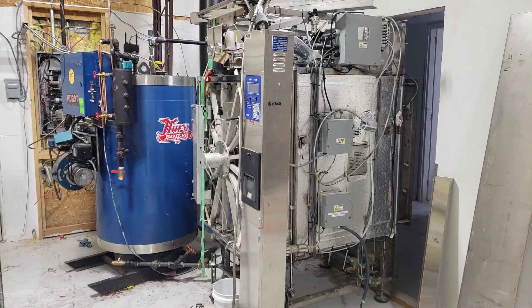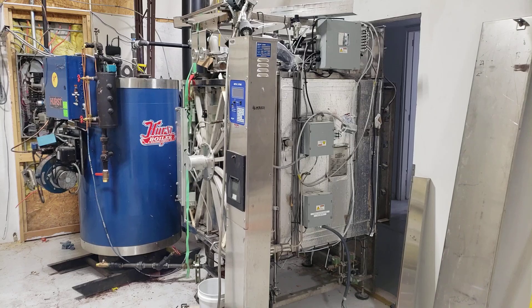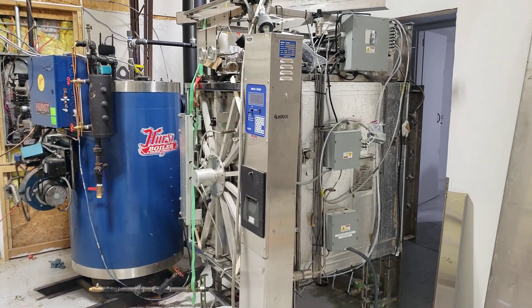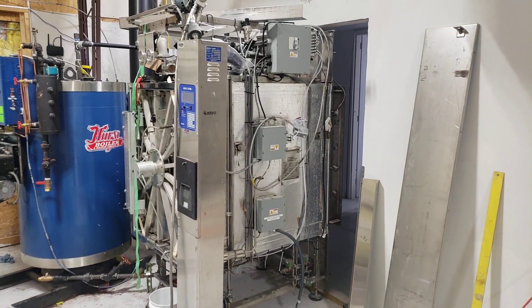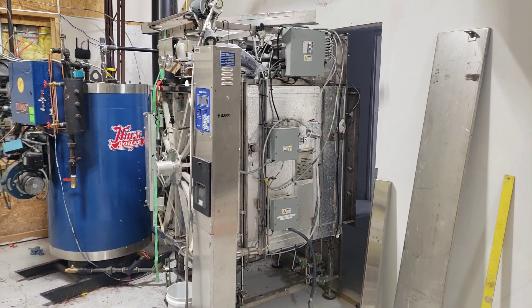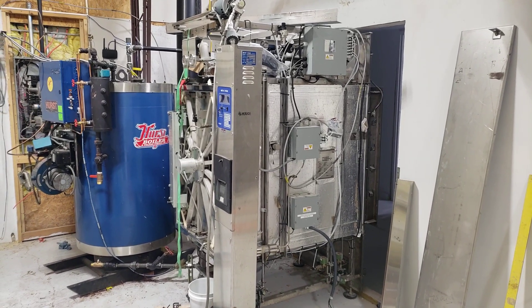Welcome. This video is about autoclave and boiler installs for mushroom cultivation. If you're at the point where you want to be making mushroom spawn or making multiple batches in your sterilizer a day and you want to autoclave, this video is for you.